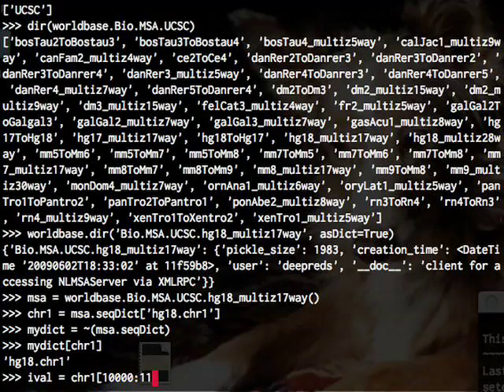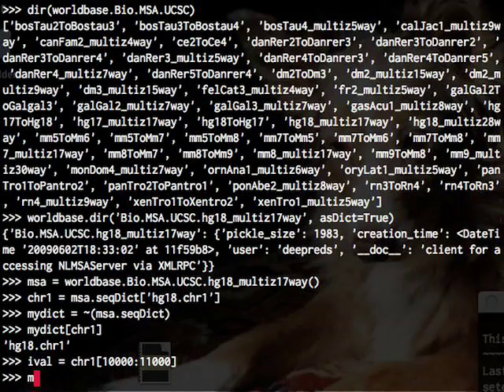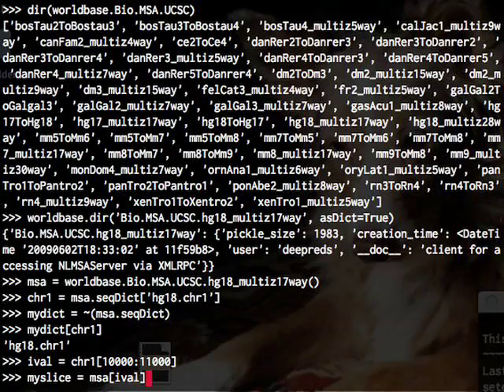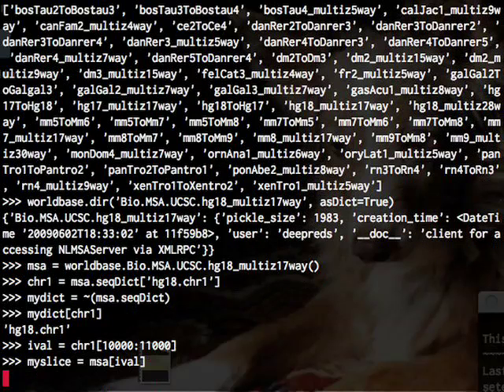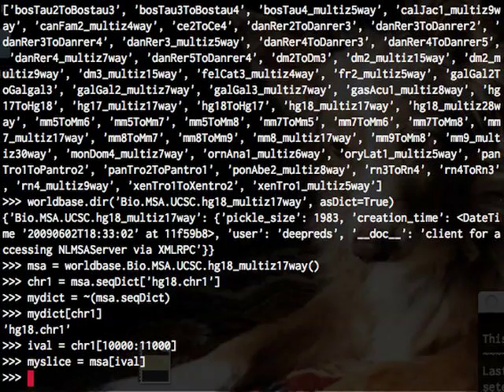Now I start slicing this data. I take a little interval of chromosome one out of the three billion bases in the human genome.